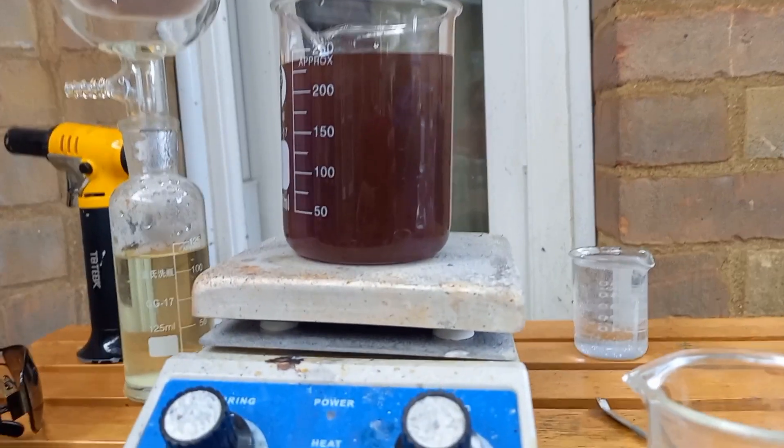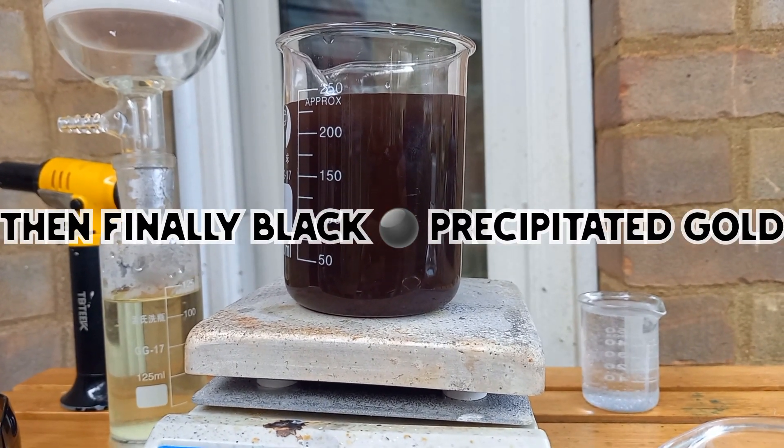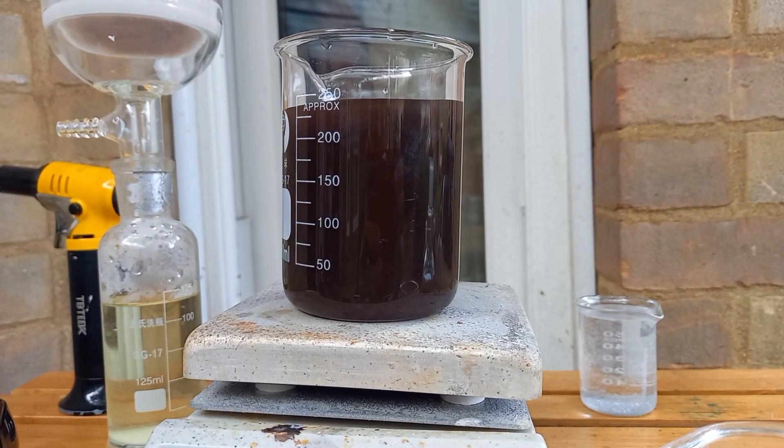Oh, look at that purple. Are you fucking real, man? Come on.